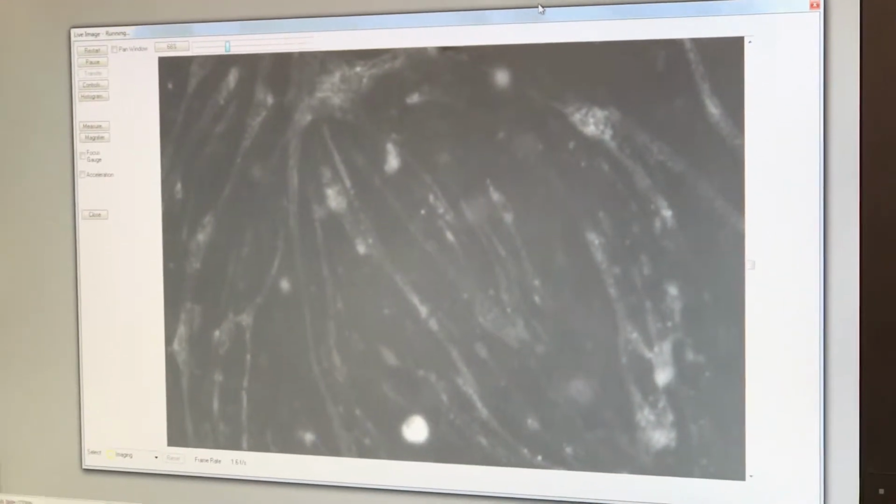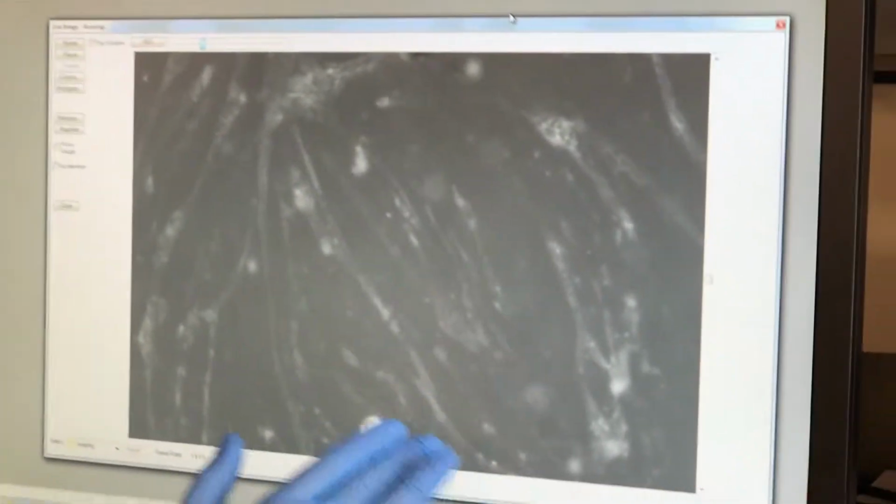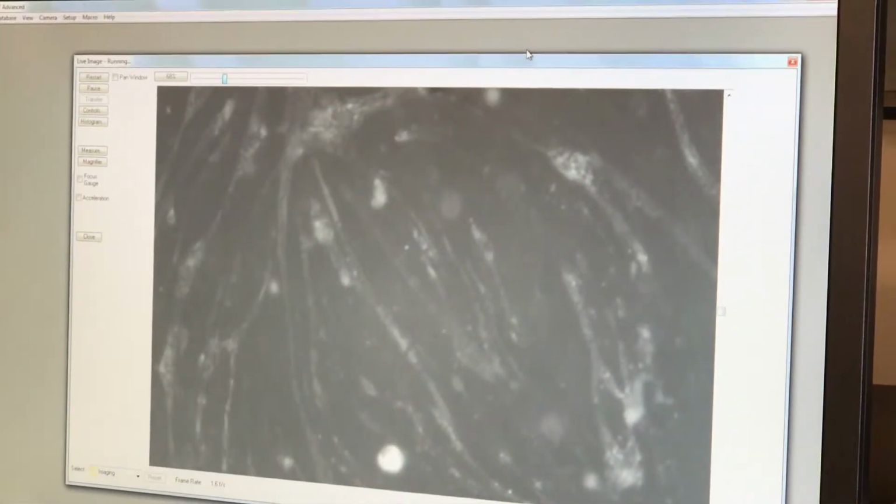Now, in the context of an existing muscle cell or myofiber. That's essentially what this is. These are myofibers. When Mustafa cultures the myoblasts at the beginning, we have to use certain conditions. They have different growth factors and different things in the media, which is the pink stuff that feeds the cells. There are certain factors that help keep them in that blast state, and when he switches it over to differentiation, certain features of the media give it the signals to differentiate.